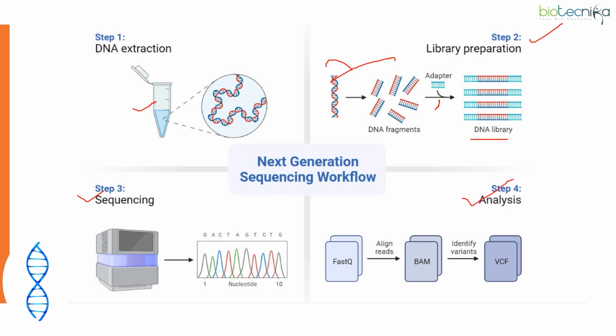After that, we can take this FASTA-Q file, and from this step, using the bioinformatics approach, we can align the reads with the BAM file format, and then finally we can identify the variants using the VCF file format. So VCF file format is called a variant calling file. There is a high chance that in this particular file, you will get novel variants or SNP kind of mutations. Getting all of you? So these are the basic steps or the workflow it will perform with the NGS technique.